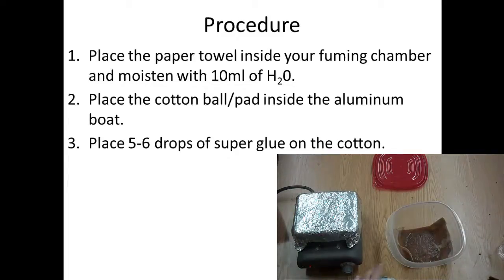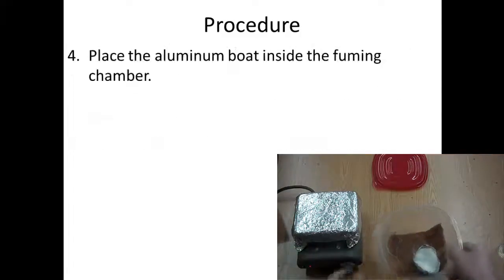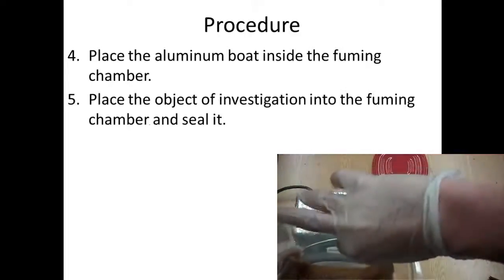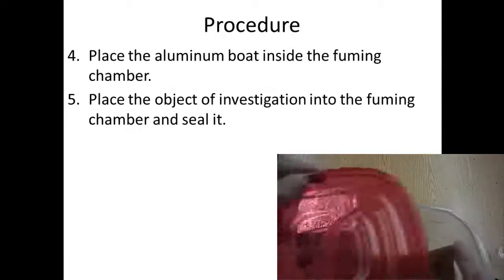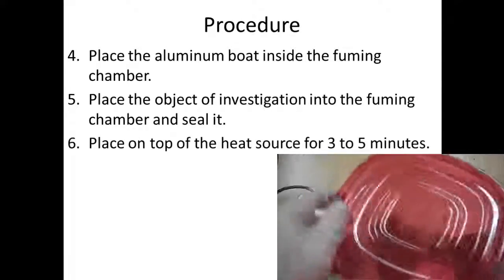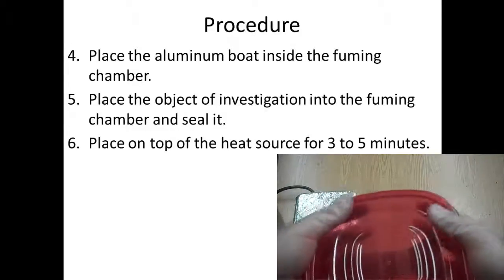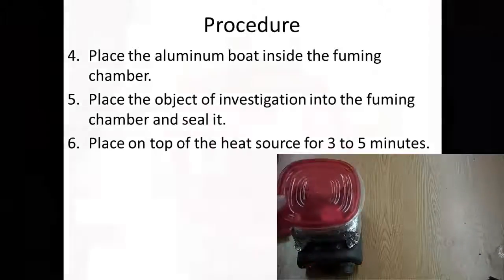Then go ahead and place the aluminum boat inside the fuming chamber along with the object of investigation and you go ahead and seal it up. And then you just place it on top of the heat source for about three to five minutes. It happens a little faster than you might think, but if you leave it longer, you'll be sure that you'll get a reaction. And that's about it.